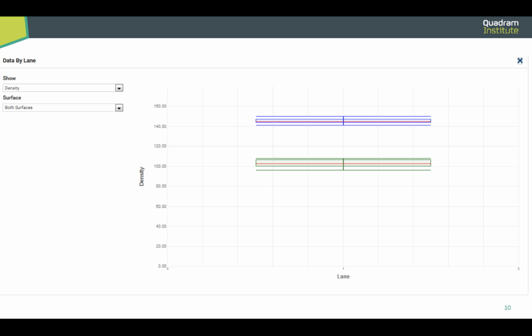If we look at some of the graphs that you get in more detail, this is quite a useful one showing how many clusters are formed on the flow cell itself. And as I mentioned, it applies some filtering as well. So this blue box chart here, you can't see all that well that it's a box chart because it's quite compressed. But the blue one represents the raw reads from the total flow cell, and the green box represents all the data after the filtering has been applied.